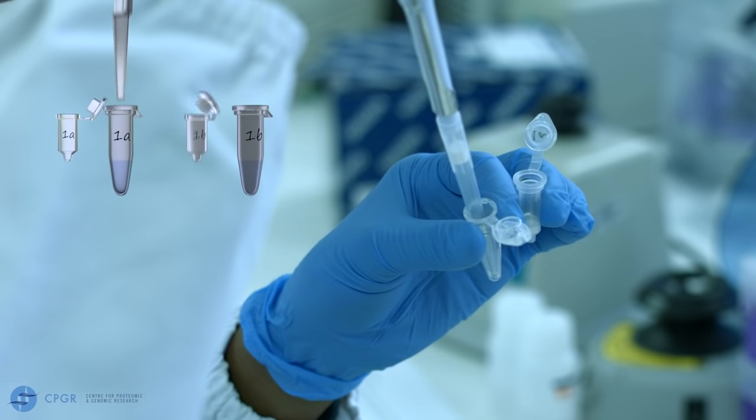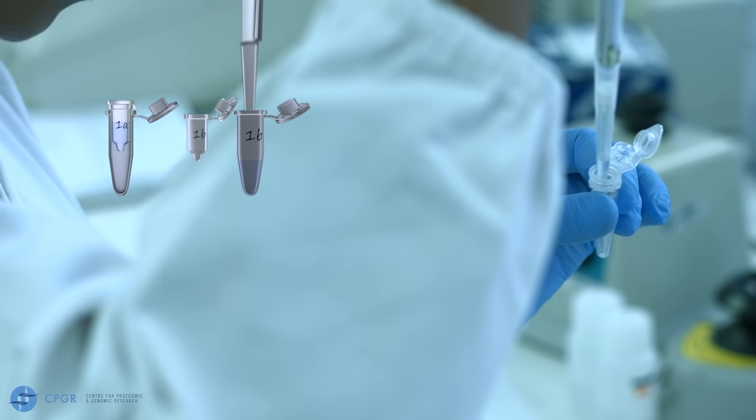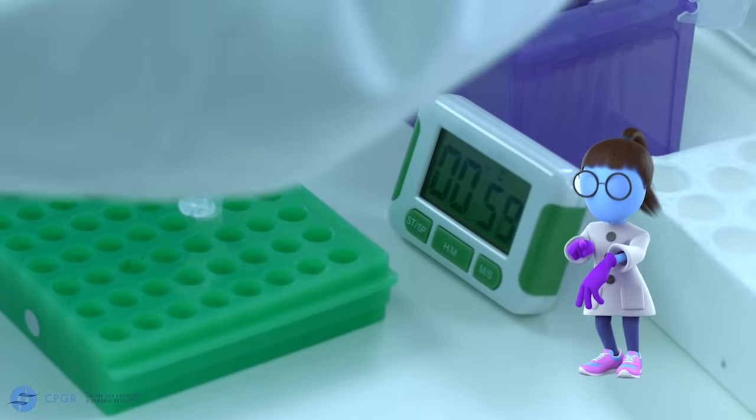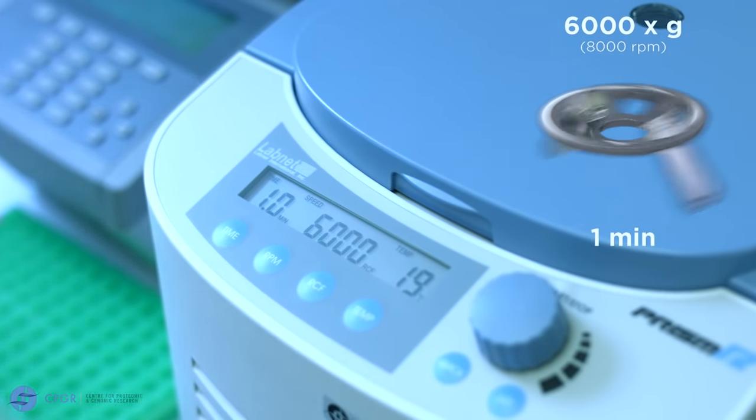Re-elute the filtrate, transferring this back onto the spin column. Repeat the incubation and centrifugation steps. This repeat elution step optimizes the DNA yield for each sample.